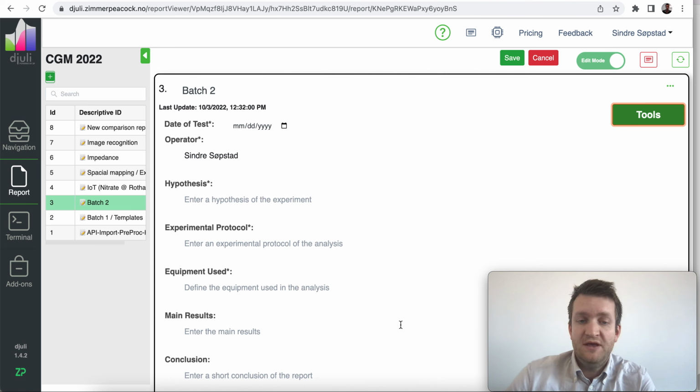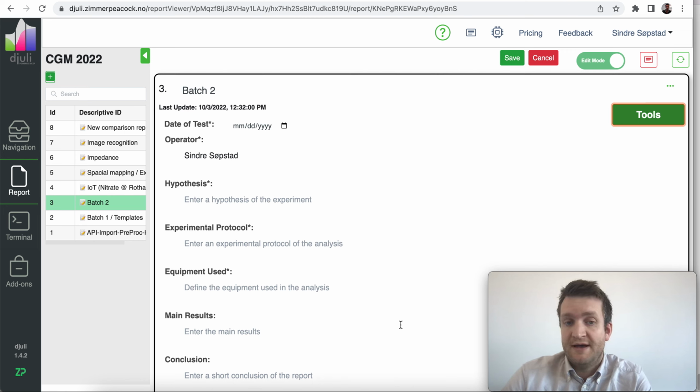Templates are a means of automating a process flow that is starting to become repetitive. Repetitiveness is typically a sign that the product is maturing. So we're standardizing the tests, both for tracking progress and for seeing whether a released product is within the constraints of our acceptance criteria and so on.